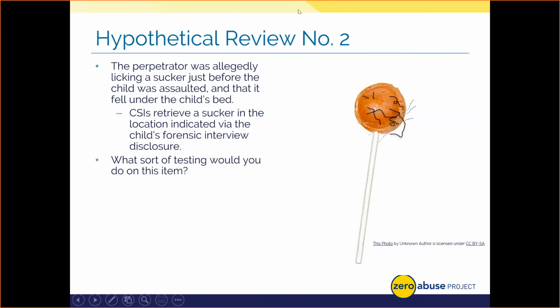Saliva, okay. Hair and saliva, yeah, you're noticing some of that trace element on there. Very nice. Somebody said go straight to DNA. All right, nice. Yeah, because remember, this is an item that we talked about where its use in and of itself would indicate potential saliva. So maybe we don't do saliva testing. Yeah, those are all great answers. And remember, there's no necessarily one wrong or right answer on this. A lot of this is our discretion.